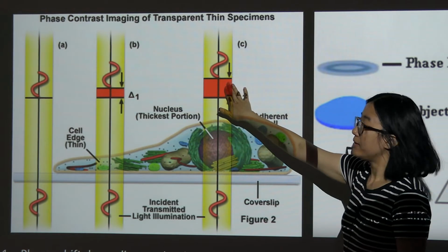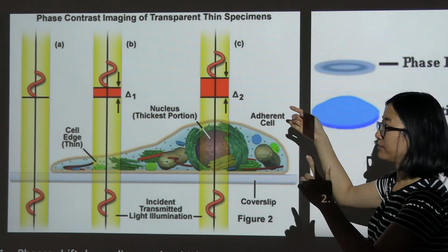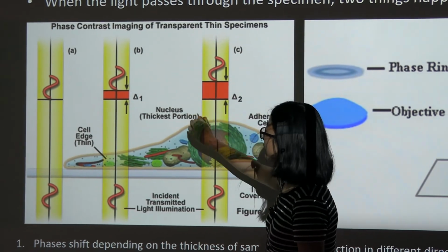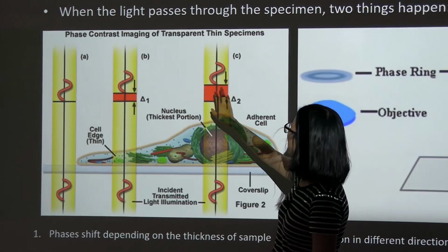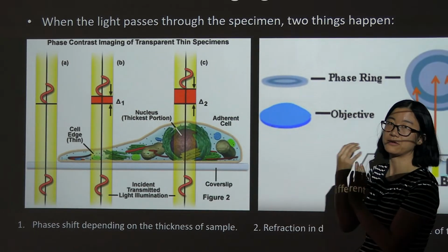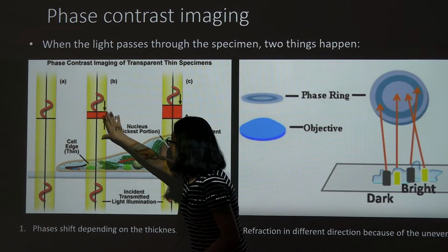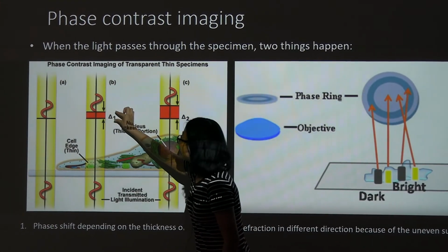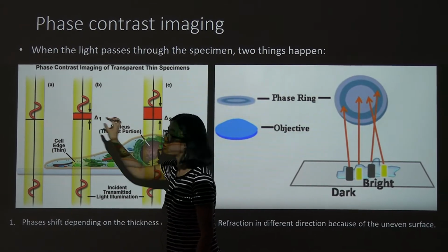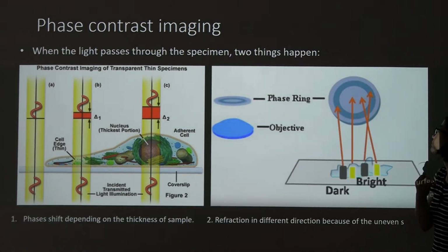So this could be easily recognized, if it happens like interference with some light without changes, by your eyes. But when they go to the very thin transparent sample, the shift here is too small, and your eyes couldn't really recognize it.